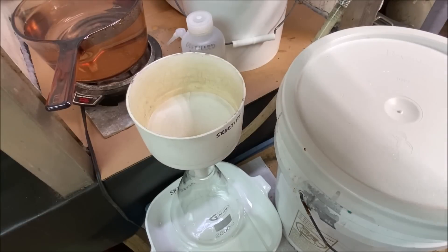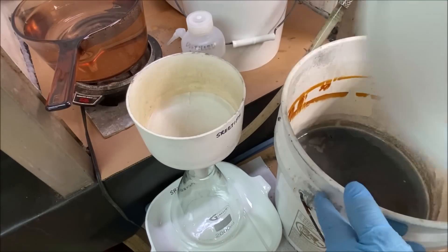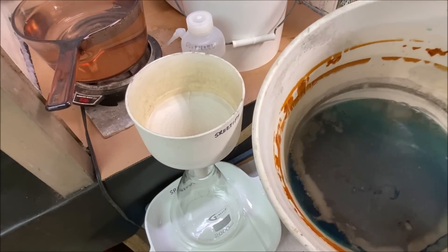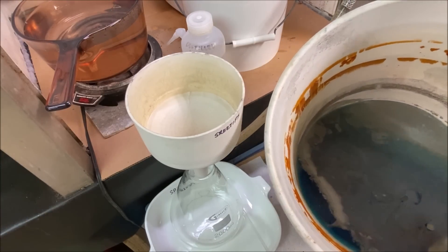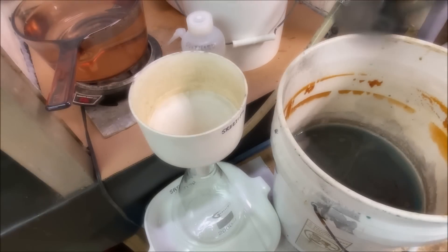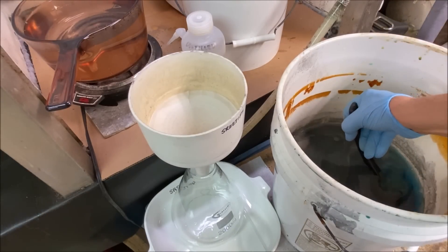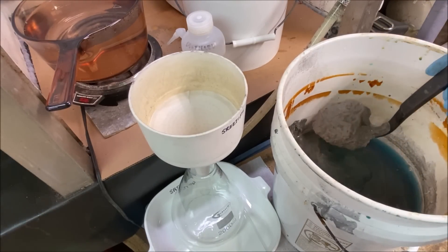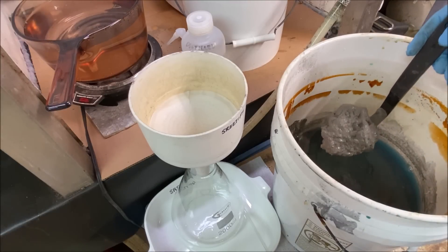I've got a five gallon bucket here and it's pretty much loaded with cement silver. Things are pretty heavy. Now what I'll do is dip some of our cement silver out of this bucket — I've been saving this up in this five gallon bucket.